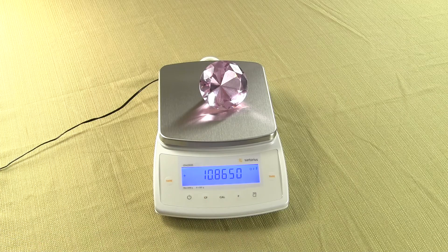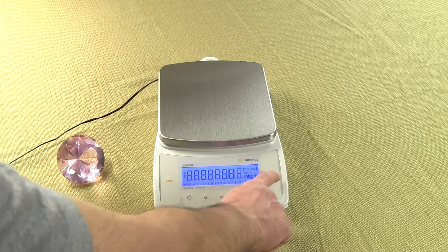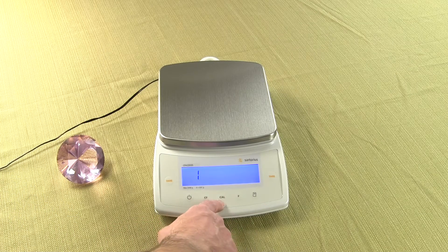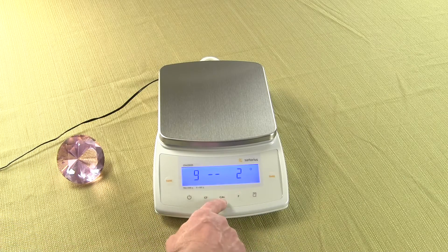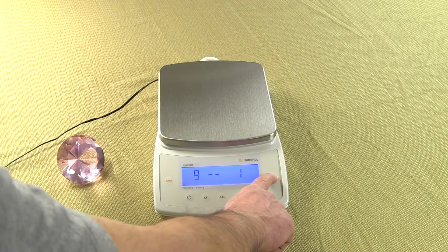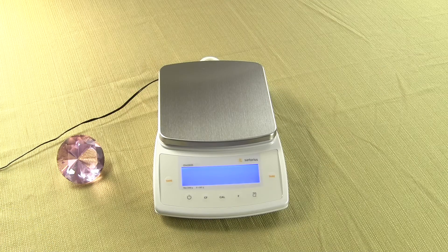So that's how you change the weigh modes — it's pretty simple. Now if you mess everything up and need to reset the balance back to the factory defaults: turn off the balance, turn the balance on, and press the tare key. For factory default settings, enter the code 9, 1. Press the Cal key to increment to 9-1. Press the tare key to store — you'll see 9 dash 1 with a 0 in the upper right-hand corner. Press and hold the tare key. This now has reset the balance to the factory defaults.